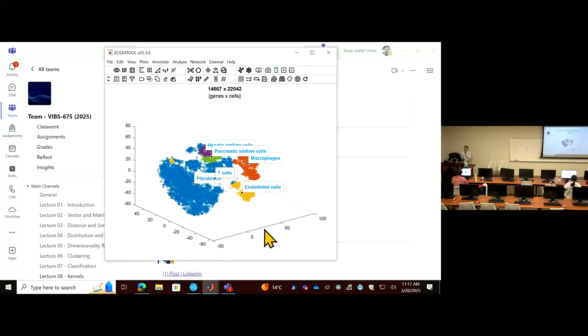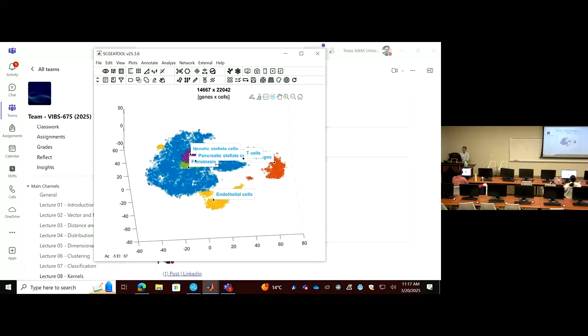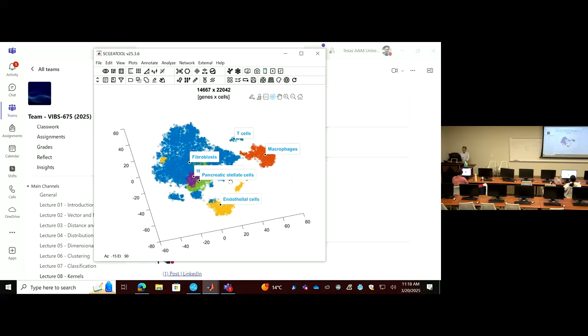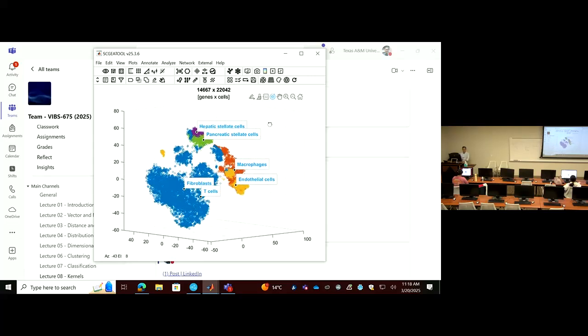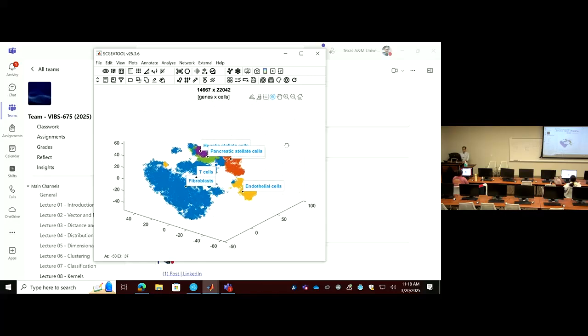Okay, so if you haven't run this, don't start it. You just look, because this will take several minutes to finish. But at the end, you will get the annotation looks like this. So this is the same as what I presented in the lecture.